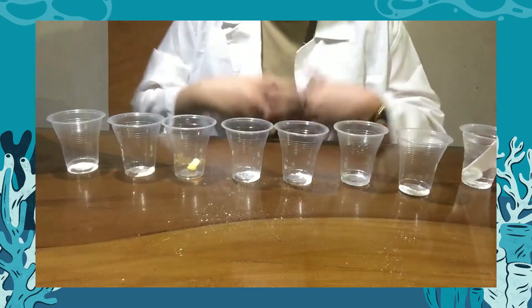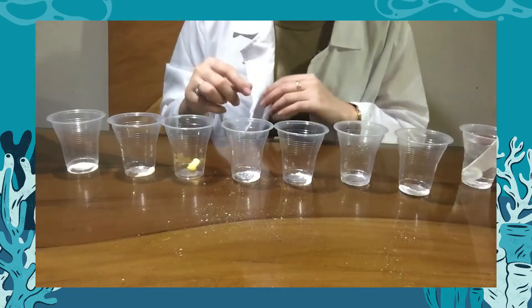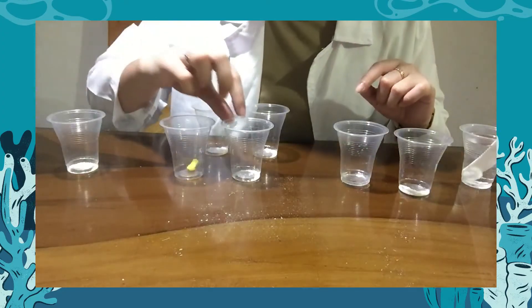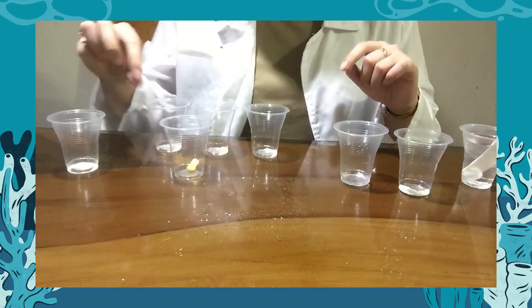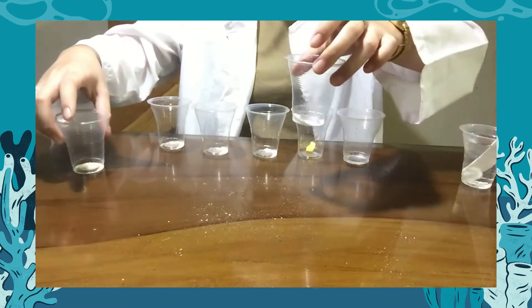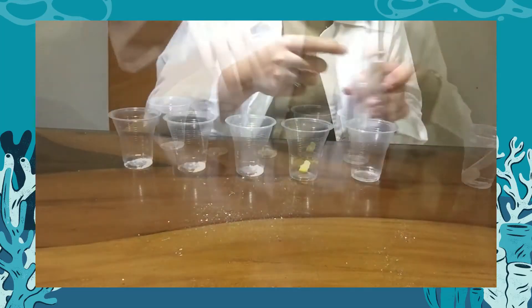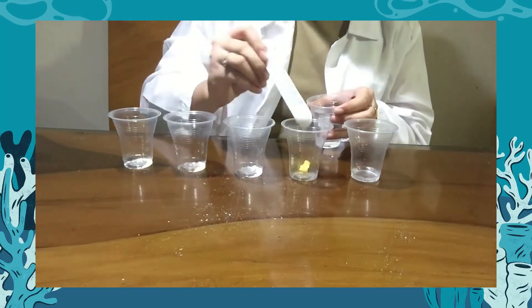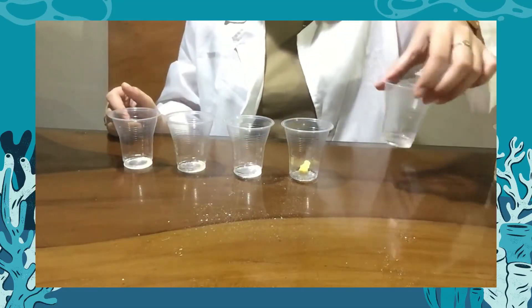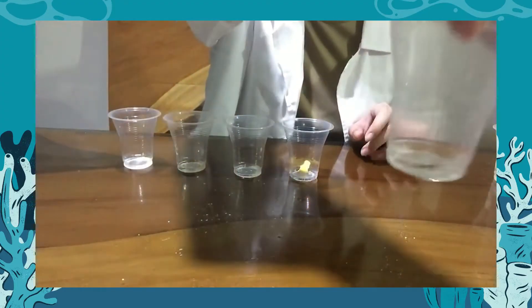We'll start with putting about 0.5 grams of the following substances: sodium chloride, sugar, gelatin powder, margarine, and ethanol. The sodium bicarbonate and citric acid powder will be set aside for a moment. Now we need to add 1 ml of water to each plastic cup containing the substance, and then shake it rigorously so that the substance can be dissolved.